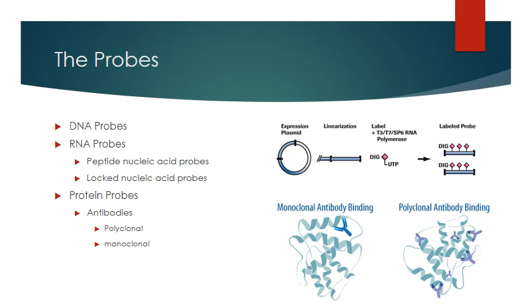They can be made in a variety of ways. One of the common ones is you can clone the sequence in a plasmid and then isolate that sequence using restriction enzymes, which would then be purified by gel electrophoresis. You can isolate these probes from viral genomes, and we can also use in vitro organic synthesis of a particular sequence. That's only good for really short oligonucleotides, because if it's really long, it's not practical to do it in an in vitro method.